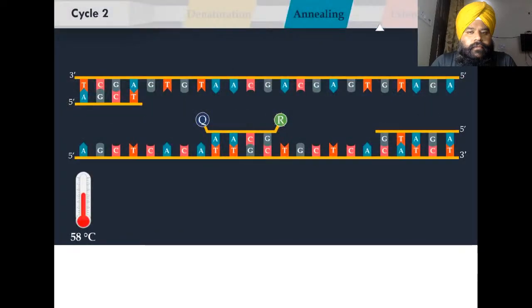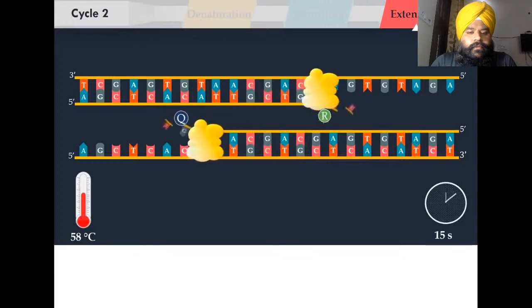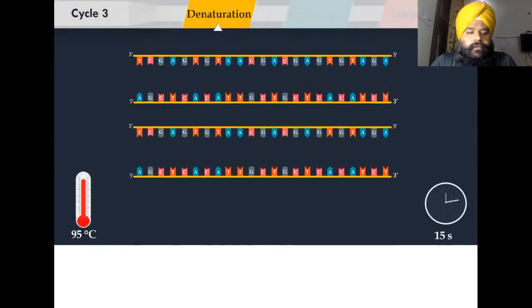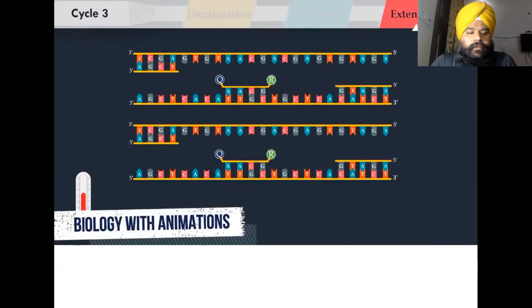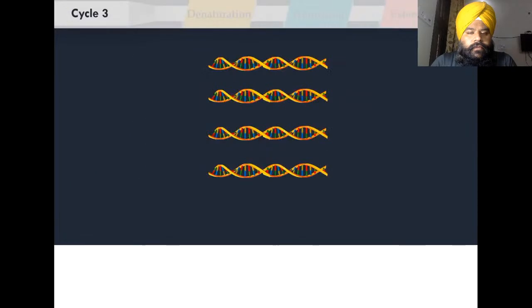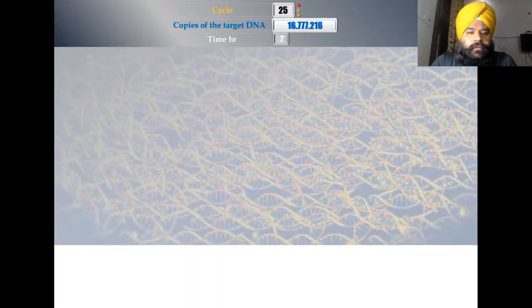In the extension step, DNA polymerase synthesizes new strands. When the polymerase reaches a TaqMan probe, its endogenous 5' nuclease activity cleaves the probe, separating the dye from the quencher. With each cycle of PCR, more dye molecules are released, resulting in an increase in fluorescence intensity, proportional to the amount of amplicon synthesized. This method allows the estimation of the amount of a given sequence present in a sample. The number of double-stranded DNA pieces is doubled in each cycle, therefore, PCR can be used to analyze extremely small amounts of sample.